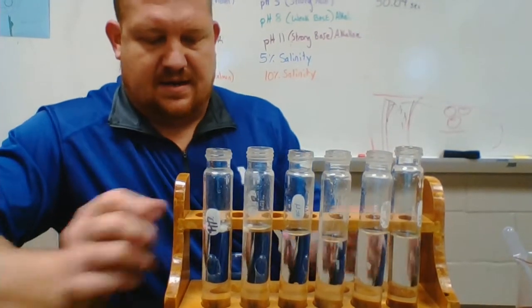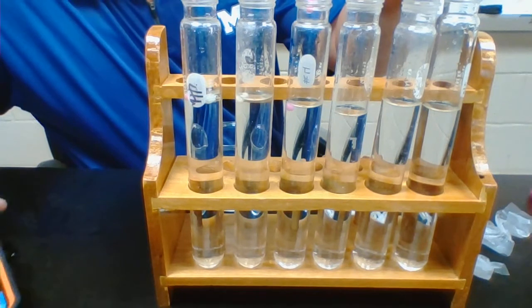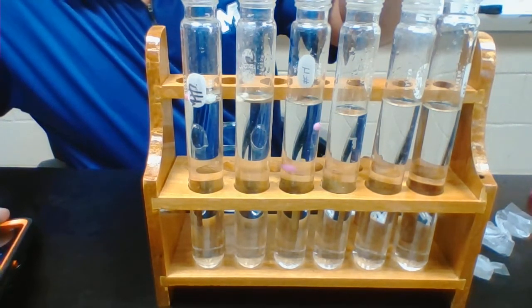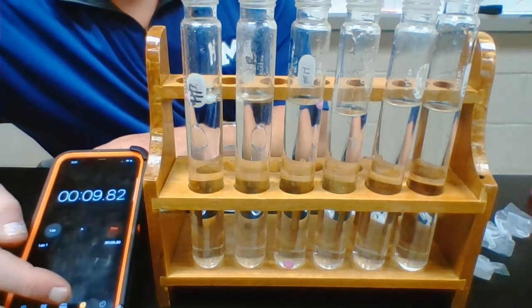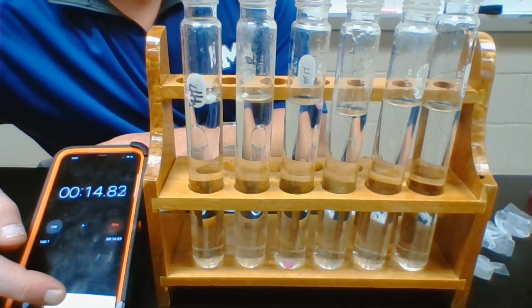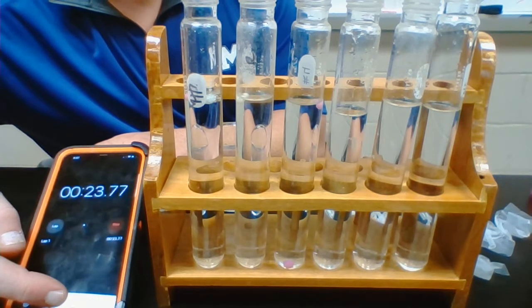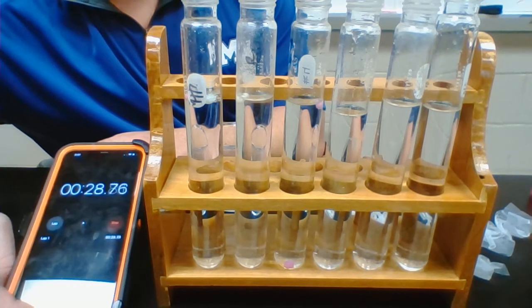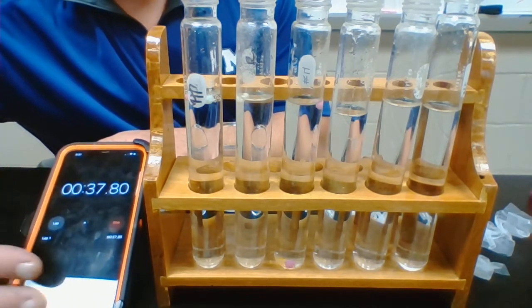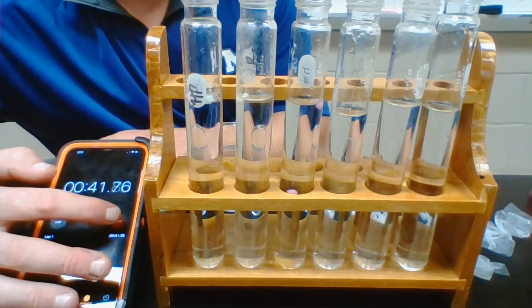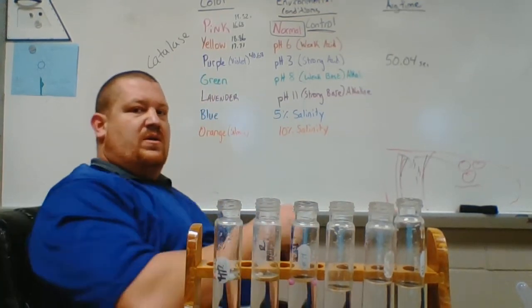Alright, sorry I cut it off when I tried to move the screen. I'm not starting over. Here we go, we got purple ready to go in the third one here. Getting my timer ready, three, two, one, start. So we see it sunk to the bottom. Timer is going. Looks like the first attempt was not a fluke. This one is taking significantly longer to work as well, so the protein is denatured. Not all of it - there's probably just less functioning proteins than there would be if it wasn't such a strong acid. Alright, and stop. This is 44.49, I'm gonna put 44.49 up here on our chart.